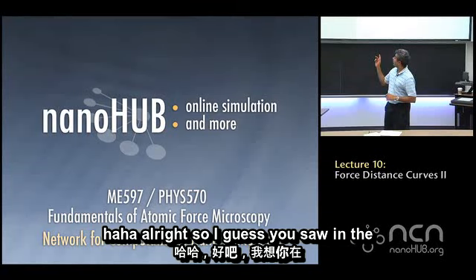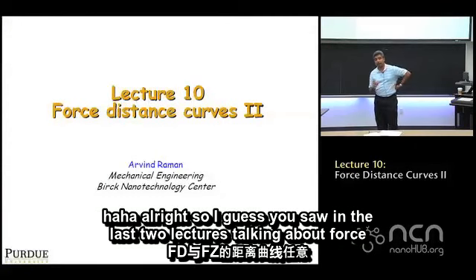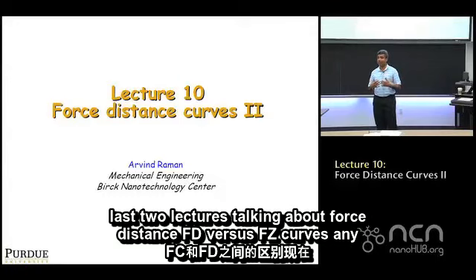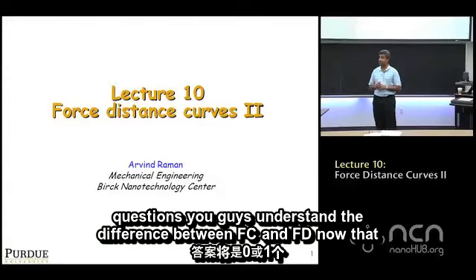nanohub.org. All right, so I guess you saw in the last two lectures talking about force distance, FD versus FZ curves. Any questions? Do you guys understand the difference between FZ and FD now?